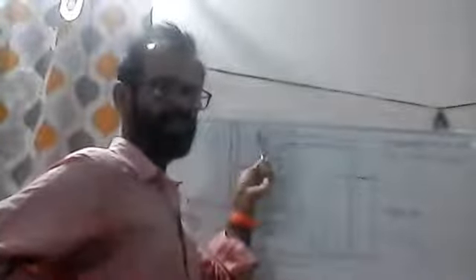Through one hole, a thistle funnel is introduced. Through the other hole, a bent delivery tube is introduced.